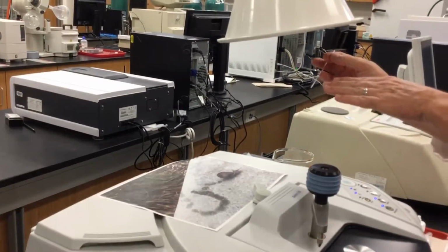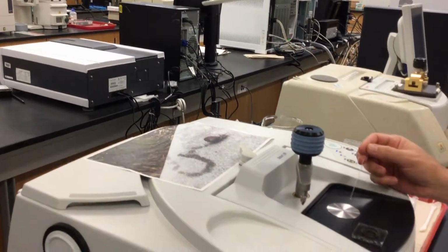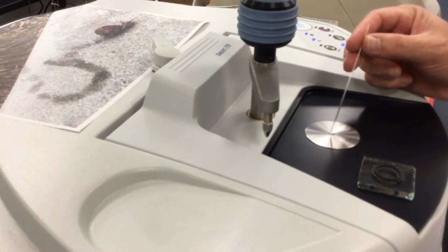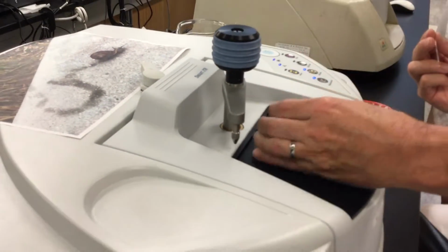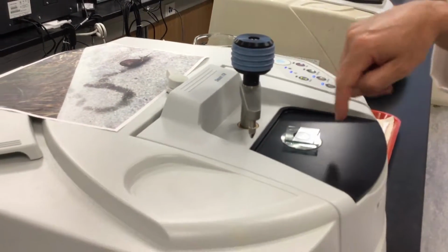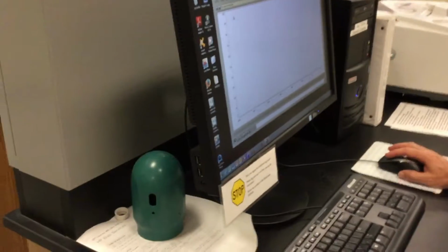This elephant trunk draws away vapors, so some of you are going to have really stinky samples. Work with it over there. And then just touch this right there, just like if you had a little bit of soda in your straw, it'll just run right out. And then we'll put that over there. And now we have liquid on there. I put that cover slip on there with the O-ring just to keep it from evaporating away.